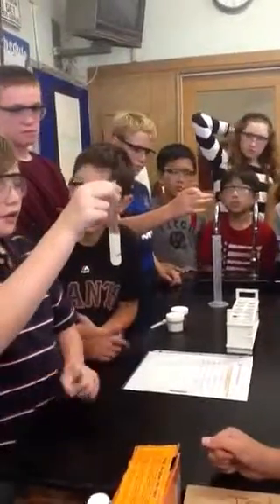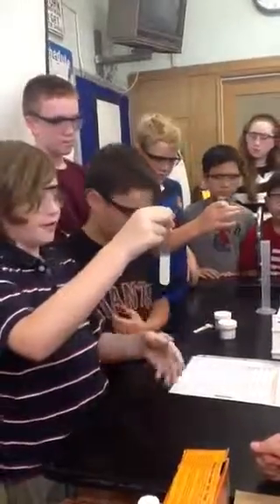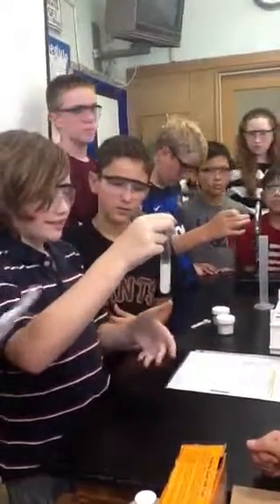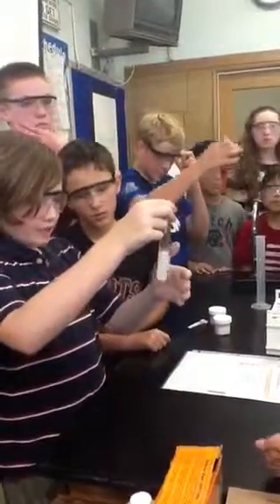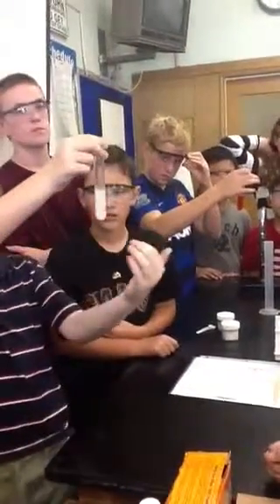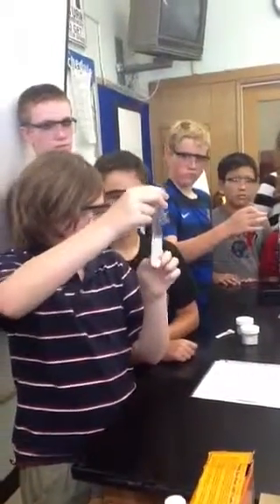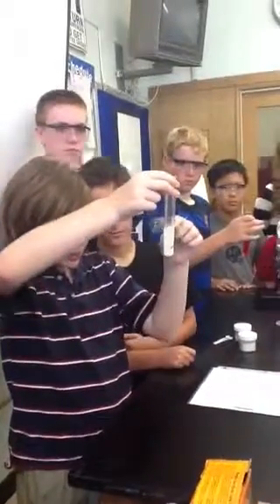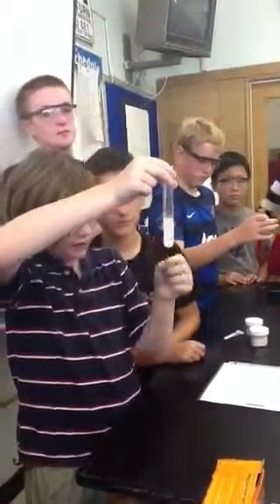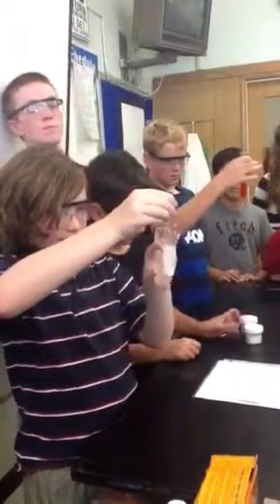Well, when substance F was exposed to water, you can see that at first it looks very cloudy, almost opaque, because you can't see through it. Although you can also notice that on the top and the bottom there are little particles of substance F still there.